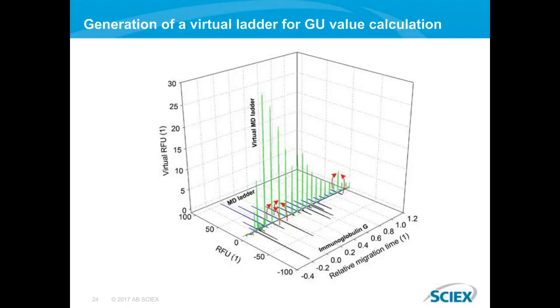In this case, these 3 components, again the maltose, the maltotriose, and the 15-mer, are co-injected with each of the samples. As one can see, this is the separation right down here of a regular IgG molecule. The maltose and the maltotriose are migrating very much faster than any components of that, and the 15-mer is migrating very much later, so it practically brackets everything.